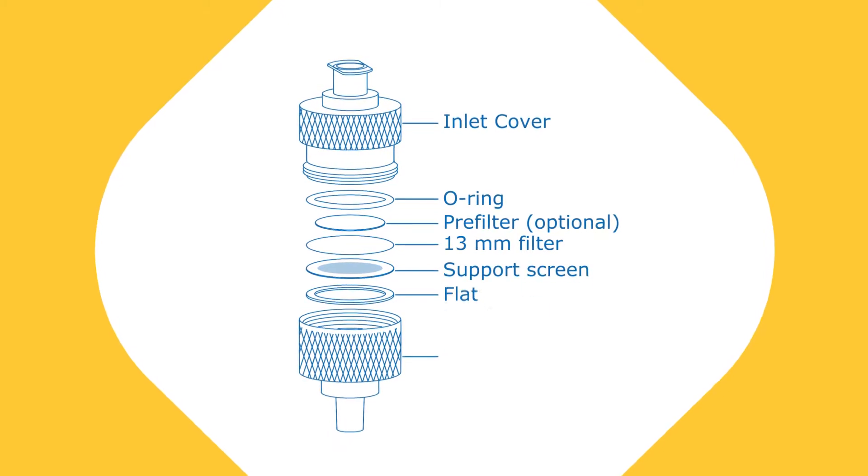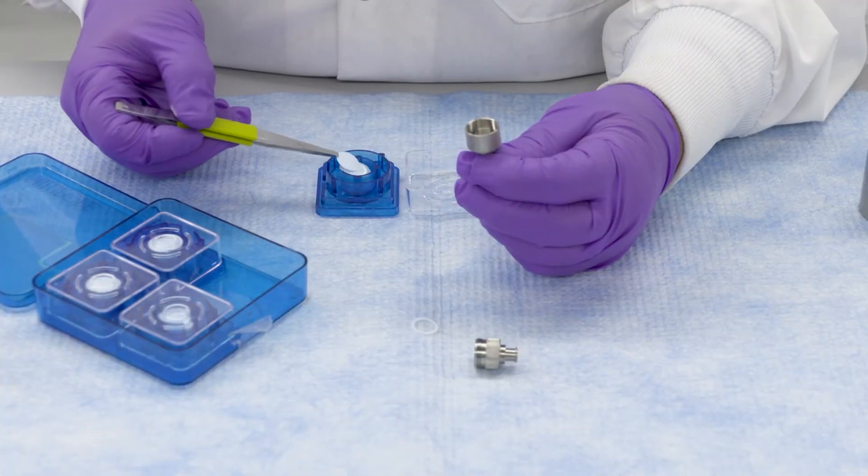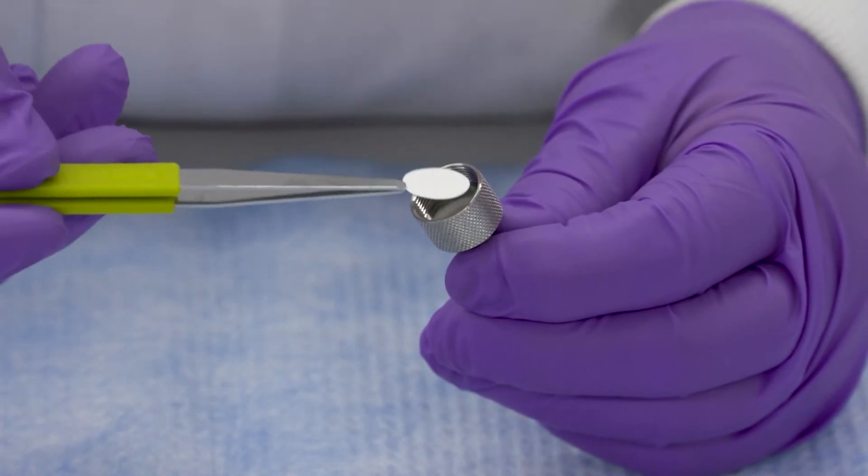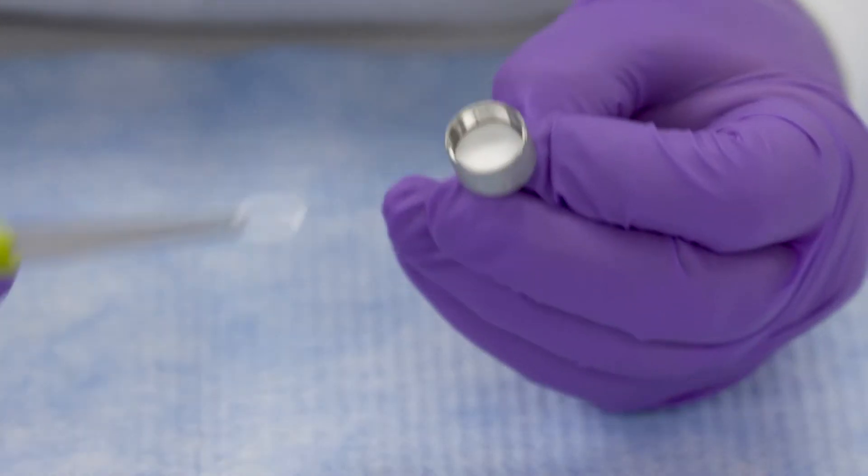Place the flat gasket into the base and place the support screen on top of it. Using smooth tip forceps, place a 13mm diameter filter on the support screen, then place the O-ring on top of the filter.